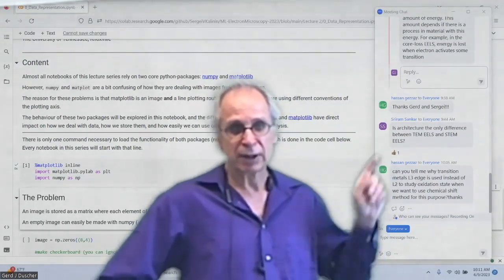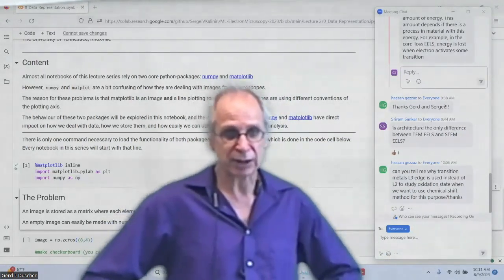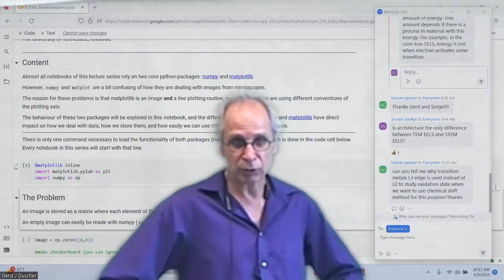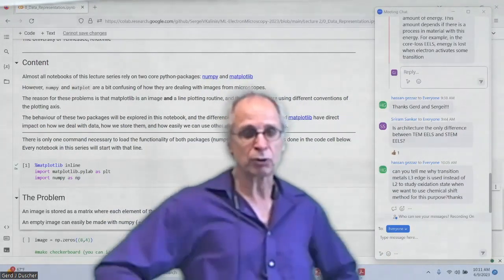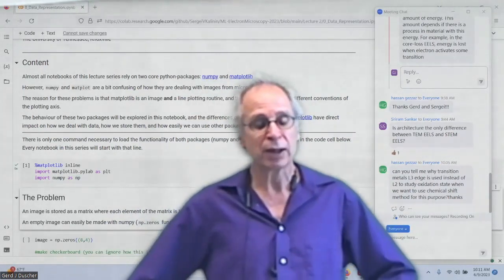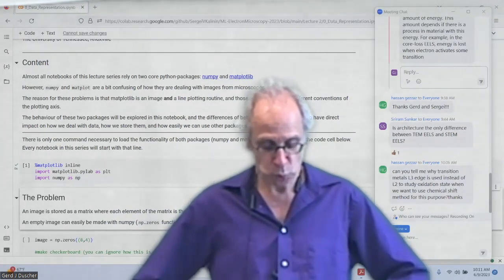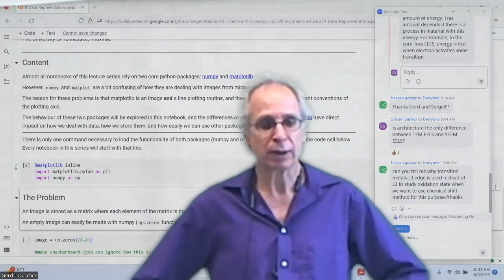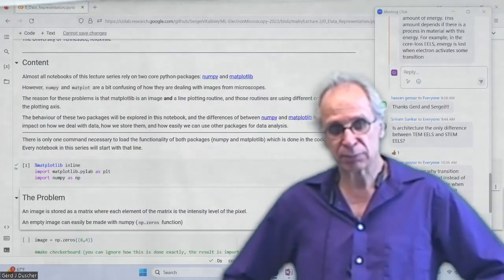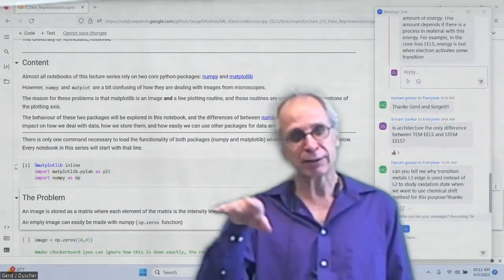In STEM EELS, you have to look at that, but in principle, they are the same from an angle point of view, if you convolve it correctly, which we will do on Tuesday. So it's the convergence angle, and we'll handle all of that.